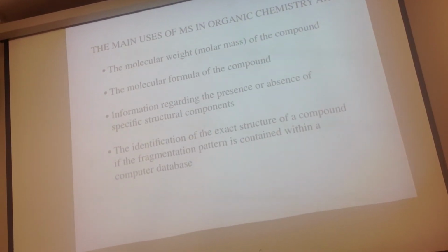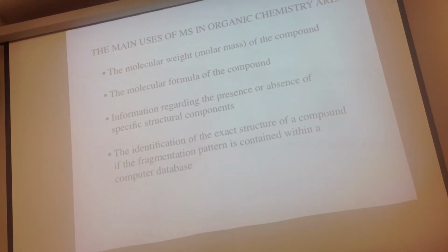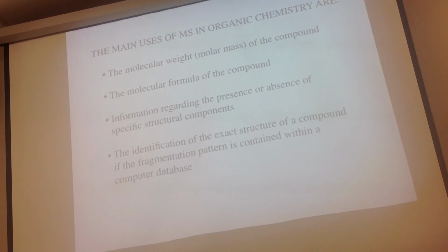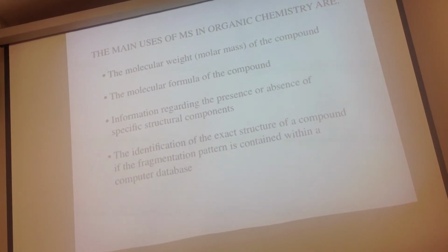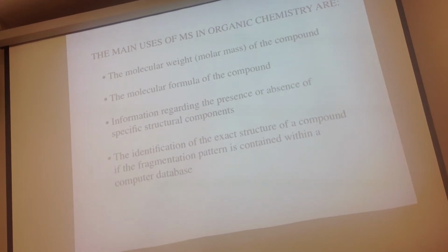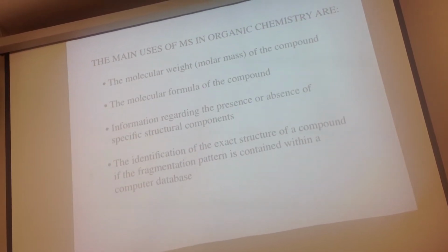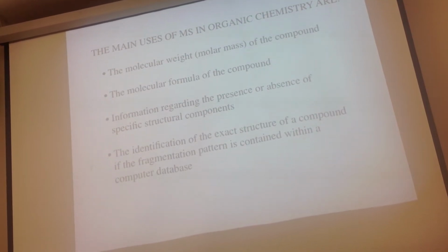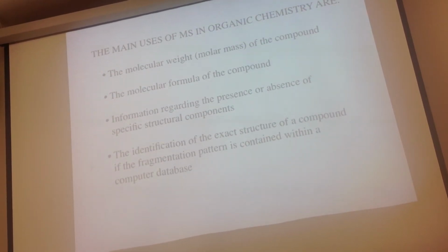It's just like an IR. Every molecule has a specific IR, right? These machines are tied into a computer database, and they would take the peaks you got, zip out, match it to the known things, and say, oh, that was cocaine, or oh, that was flour. You know, that kind of thing.